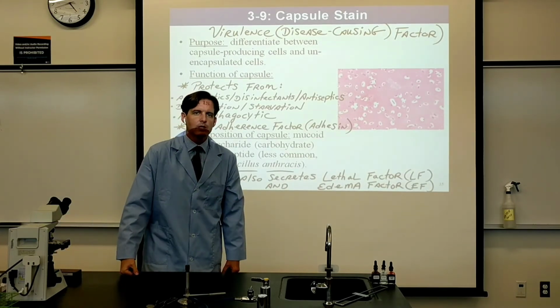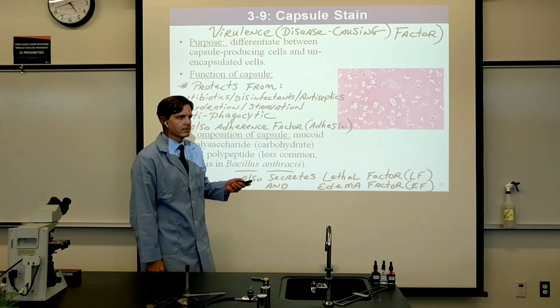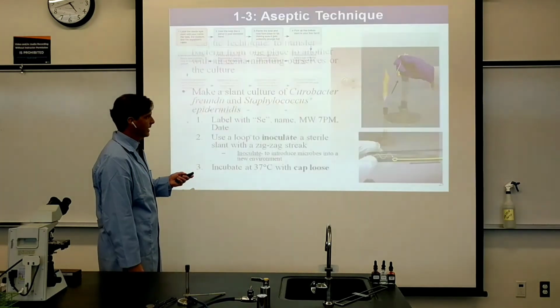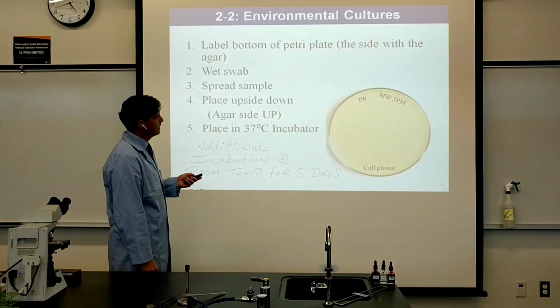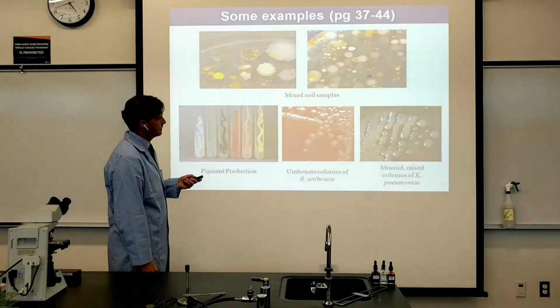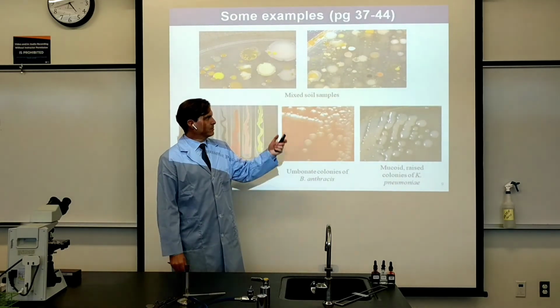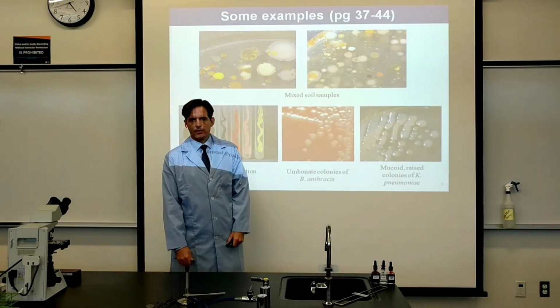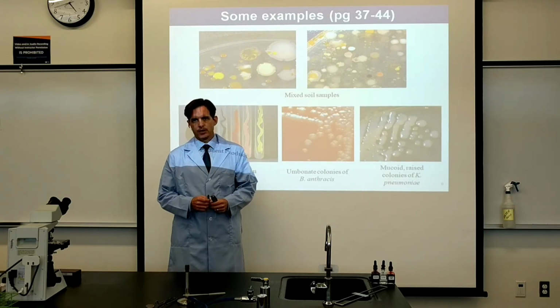And we're going to now take a look back. So one last time, we're going to look back at the environmental samples that we all looked at from the first day, from the bottom of my shoe and the microscope. And so there are various types of colony specimens or appearances that the bacteria can take on as they grow on the plate further into maturity.